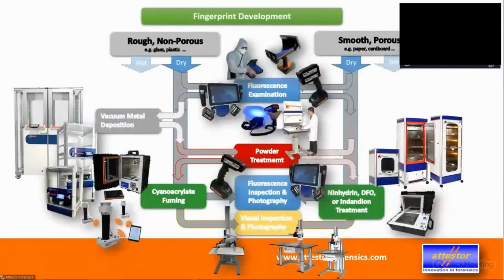And that's basically the program. So what I will do now is I switch to the camera and show you some stuff on the actual machine. So what it does, it tests, are the fans working? Is my filter sensor correct? Is there enough airflow? So several steps to go through there.